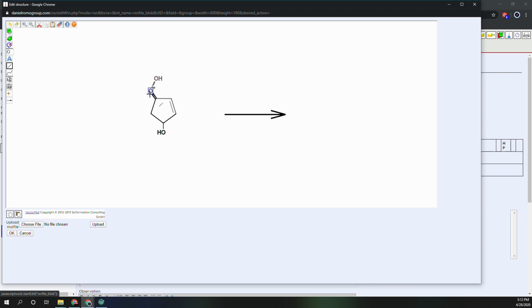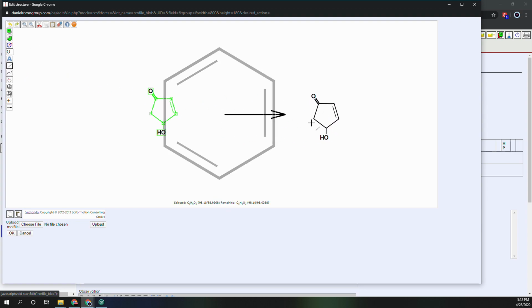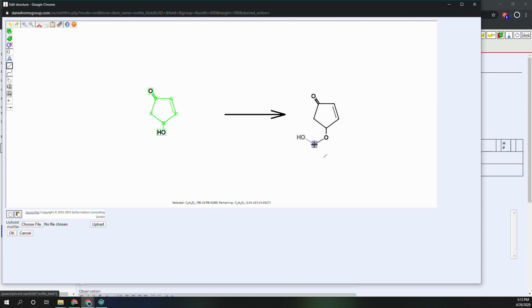There are options for different drawing tools within Open Inventory, even a ChemDraw one. Unfortunately, we cannot get the ChemDraw plugin currently from Cambridge Soft. I contacted their support. If we can get that, that would be really nice because we can just basically use ChemDraw inside Open Inventory and use the program that we know and love.